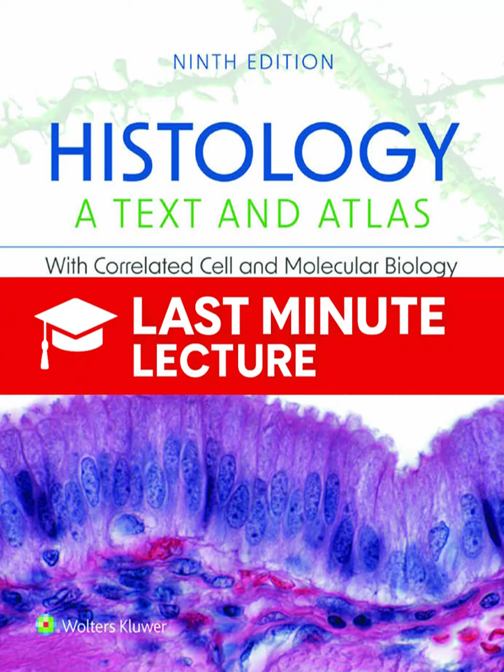Fluorescence microscopy is foundational for almost everything we've talked about in the last 2 phases. It is the absolute workhorse of molecular imaging. It uses a high-energy UV light source to excite fluorophores, molecules that absorb that UV light and then immediately emit visible light at a longer, less energetic wavelength. And those fluorophores are usually attached to antibodies. Far more commonly, yes, they're tagged onto antibodies for immunocytochemistry.